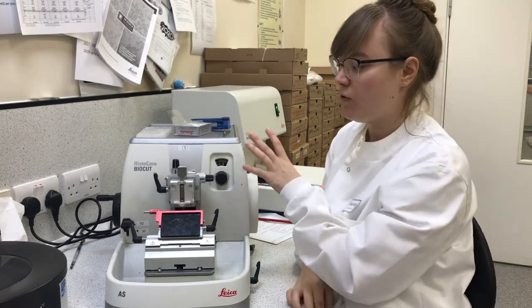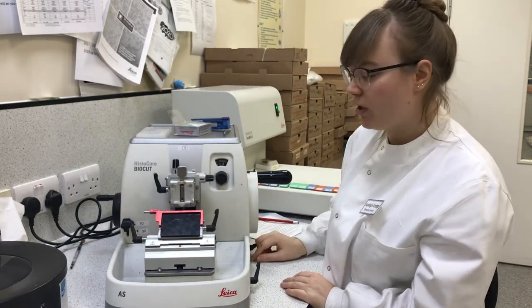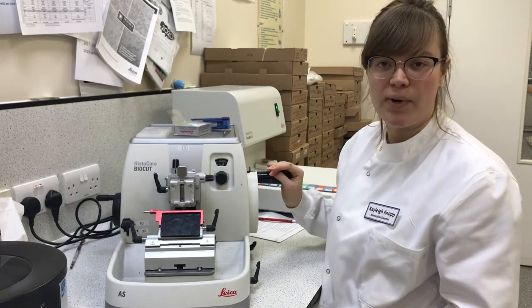You want to lock this if your fingers are going anywhere near this part of the microtome. This one is a secondary lock — flip it up, and even if you're unlocked you won't go anywhere.